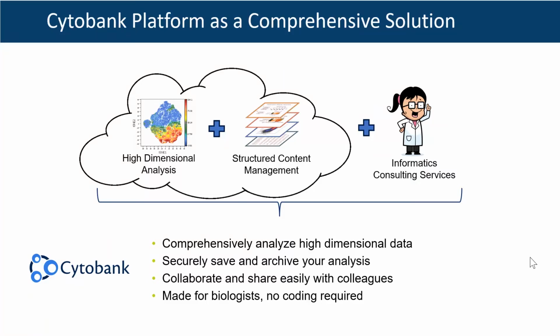And because we're in the cloud, we can securely save and archive all of the data analysis. So not only the data files will be there, but we'll be able to archive all of the experiments and all of these advanced data analysis techniques that we're using. Once we have everything created in an experiment, we're going to be able to really easily collaborate and share with our colleagues.